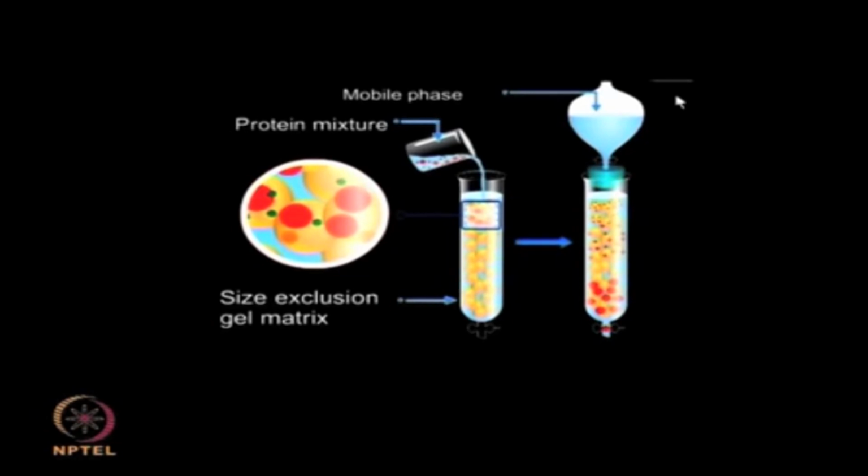The proteins are eluted out of the column by using a suitable mobile phase that carries the protein out for elution. For gel filtration, a salt solution of appropriate strength is commonly used, so that it will not have any effect on the properties of the proteins being purified. Solvents or buffer systems are often used in other types of chromatography.